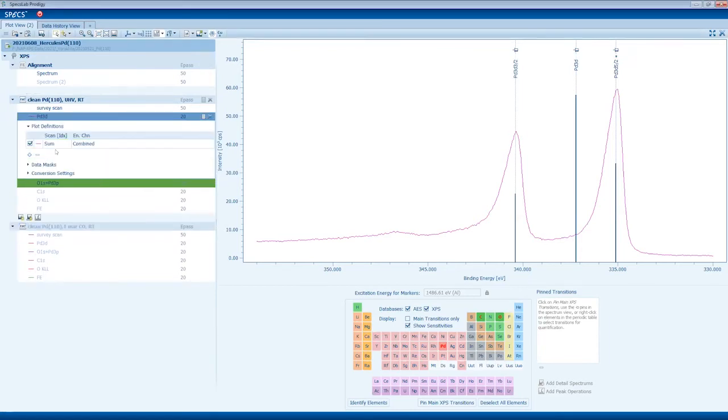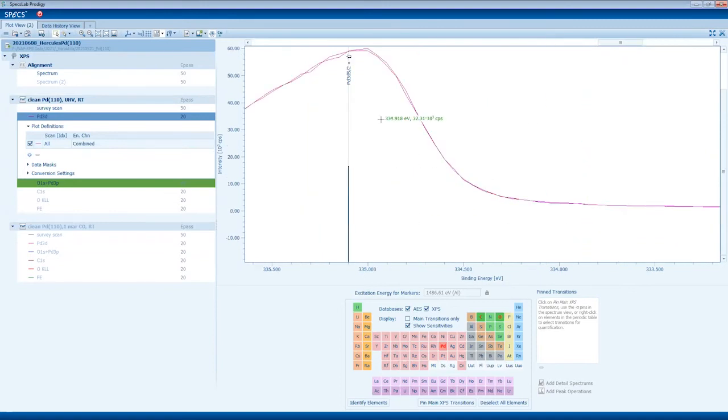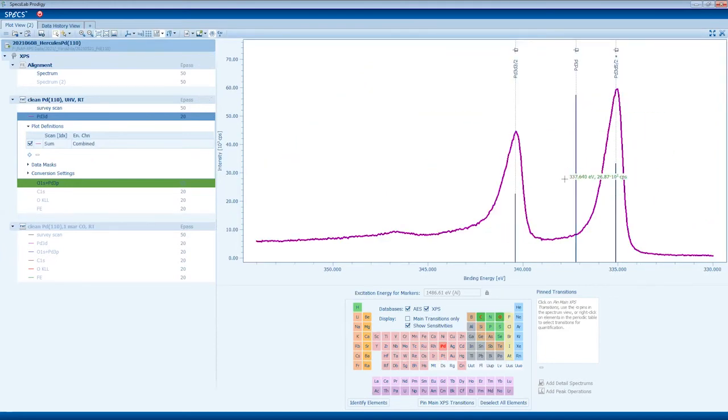We can display those two sweeps. Oh, there's only one. No, there are two. Okay, I can measure all of them, and you can see it's just the same. There are 2 lines. Now it's measuring oxygen 1s. Yeah, so there are only 2. You can also show each of them. Sometimes, if you want to see if you have some changes, you can switch between sweeps. If there are more sweeps, you see here 1, 2, 3, 4, 5. So usually we use sum, so you see the sum of the averaging of this.